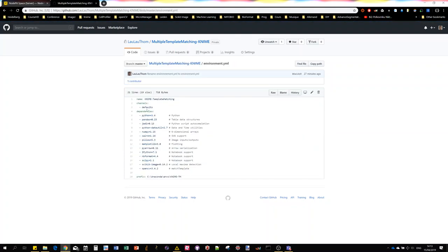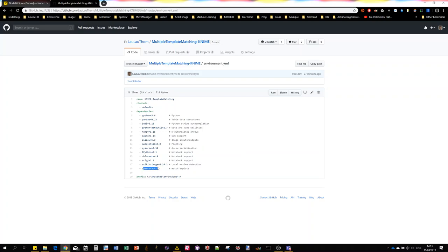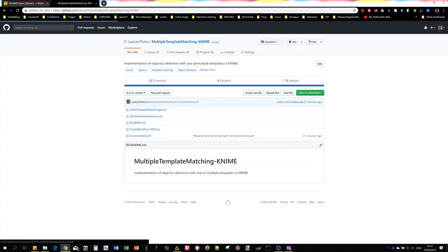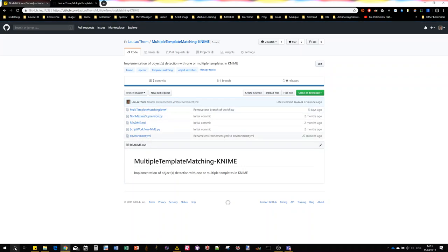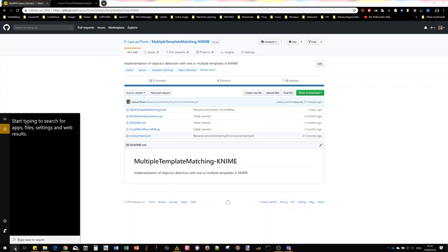And the second important file is this environment, which is for the Anaconda Python environment manager defining every dependency necessary to run the workflow. As you can see there's OpenCV, scikit-image and a number of them.